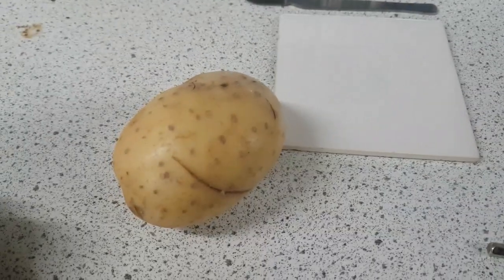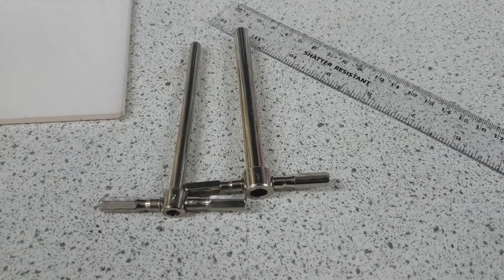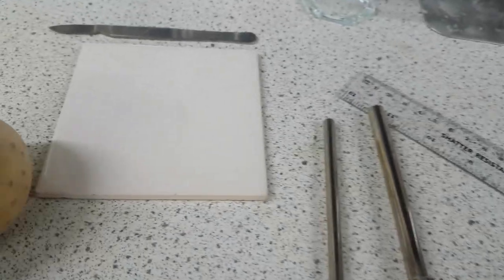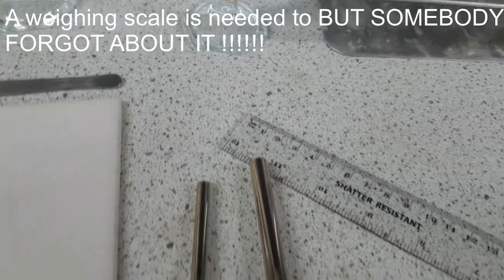Very simple experiment. For this experiment we will need the potato, cork borers—one is bigger than the other, you'll see why in a bit—a white tile, a scalpel, and a ruler.